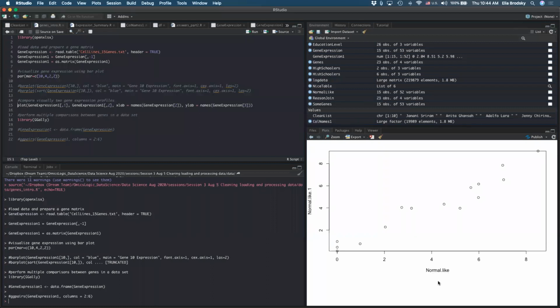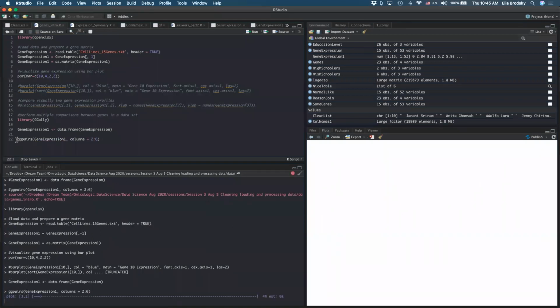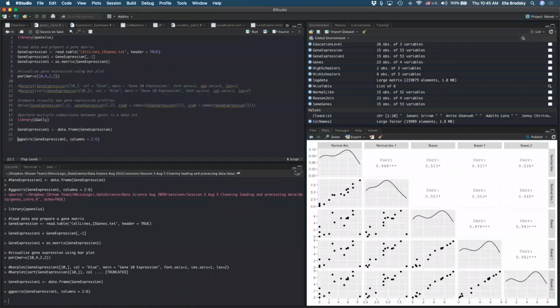So if both of these are normal-like, I expect my expression values to be highly correlated, right? We can further see that with actual correlation, right? So here we further then did something that looks like this. And we saw that, for example, normal-like and normal-like has a good correlation value. But if we look at normal-like versus basal, that correlation value is lower, right?